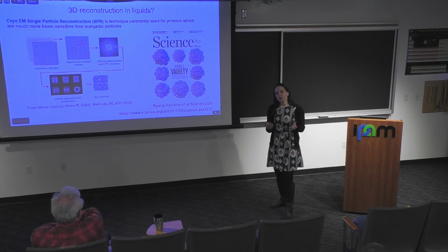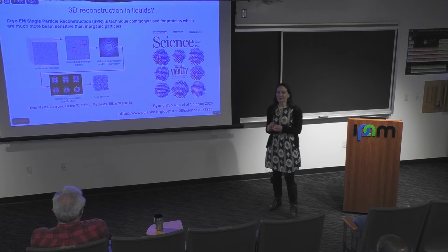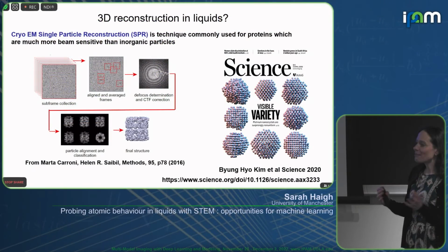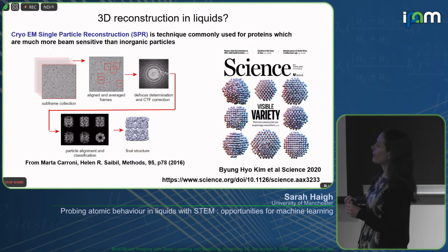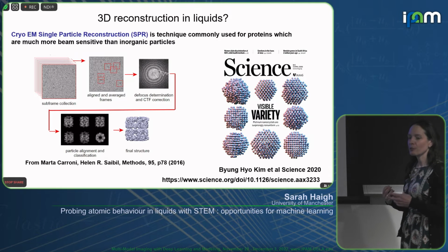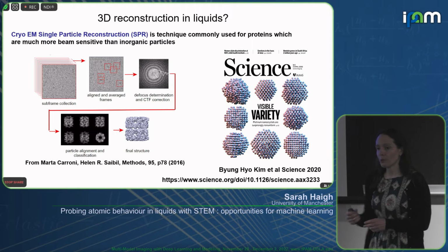Okay. So what I've talked to you about so far is all two-dimensional, and you're going to hear some lovely work about three-dimensional microscopy later on today. I'm just going to give you a little brief introduction to some of the work that we've been doing in that space. Many of you may be aware of the use of cryoelectron microscopy to create three-dimensional reconstructions of proteins, and this is the single particle reconstruction approach.